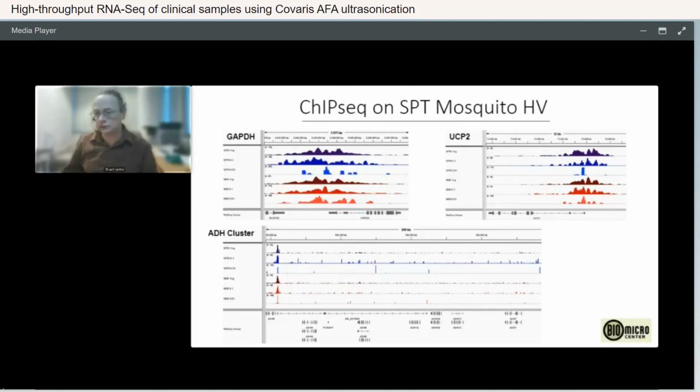The last gene to show you is the alcohol dehydrogenase cluster. The ADH cluster is active mostly in our liver, but the ADH5 gene is constitutive, and we can see that here. So this is on in embryonic stem cells, and across the rest of this cluster, we expect to see silence. And that's what you want to see, is this line be very, very low. And we can see in the blue a bunch of these little spikes showing up, whereas in the red, we've got much more consistency and very, very few reads showing.